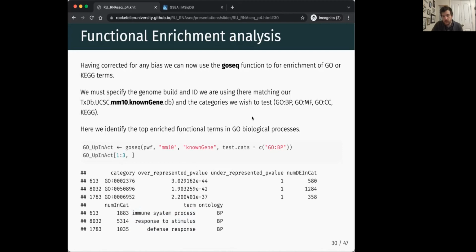So this suggests it works, and goseq, I think, is always a nice first port of call. You can do this kind of gene set analysis if you're doing ATAC-seq, ChIP-seq, any kind of enrichment analysis if you have a specific group of genes that you're interested in.